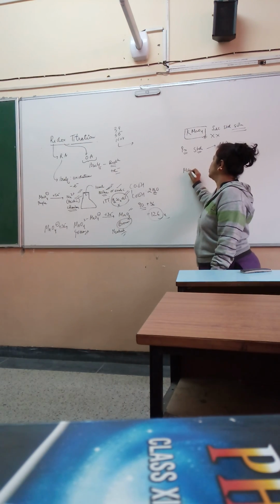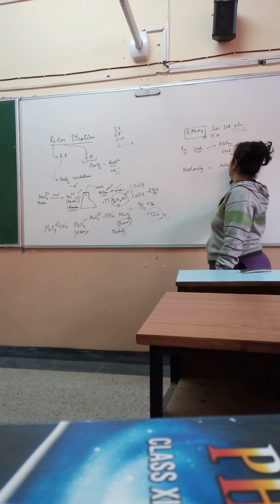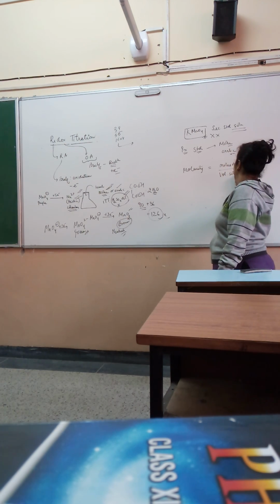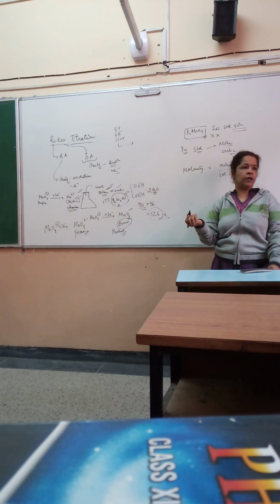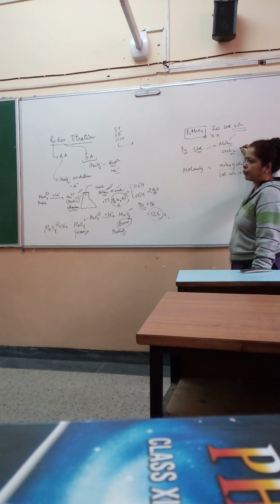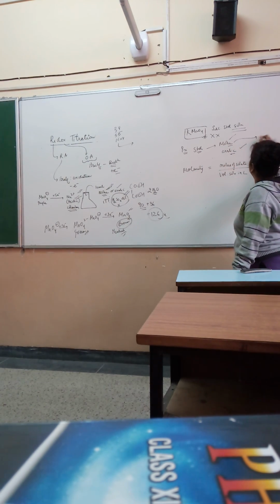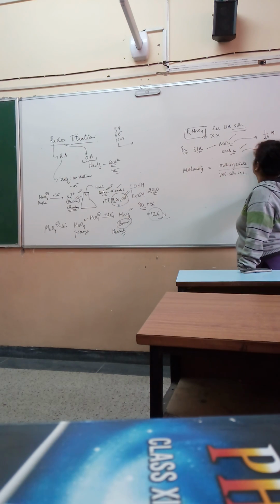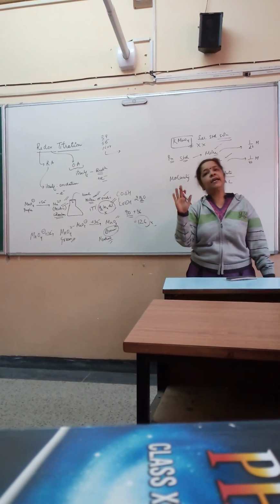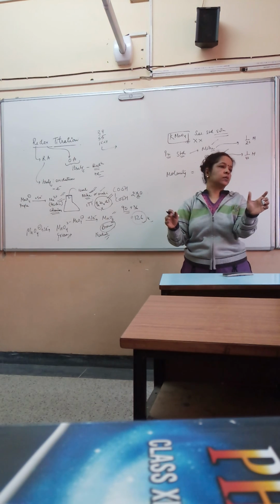The normal formula that we use is molarity is equal to moles of solute upon volume of the solution in liters. Is the formula that you are very well aware of. किसका solution बनाना है? या तो Mohr salt का या फिर oxalic acid. जिसका भी बनाना है उसकी molarity तो दी हुई होगी. Normally बेटा Mohr salt के लिए 1/20 M दिया होता है और oxalic acid के लिए 1/40 M दिया होता है normally. But there is no rule. They can change it. You can be asked to prepare a different solution also. So don't learn up the values.